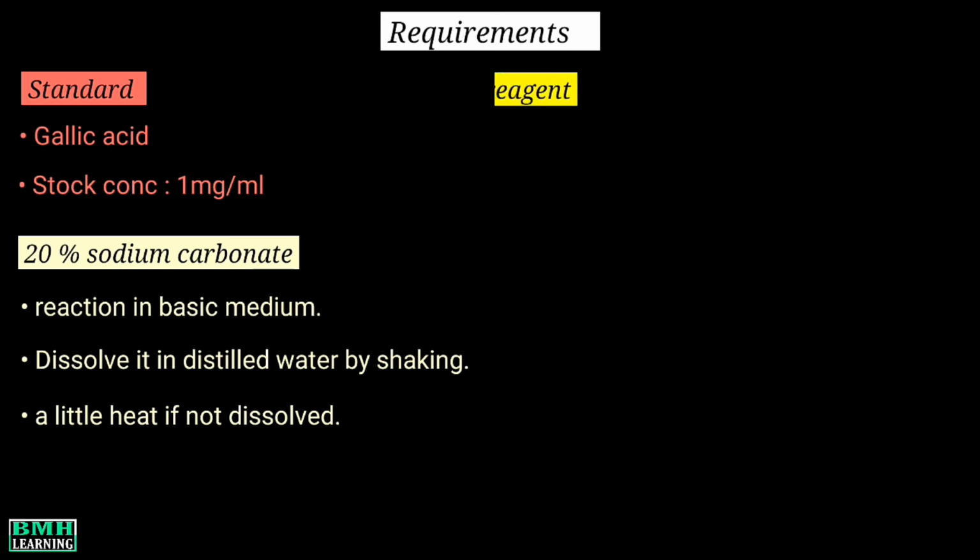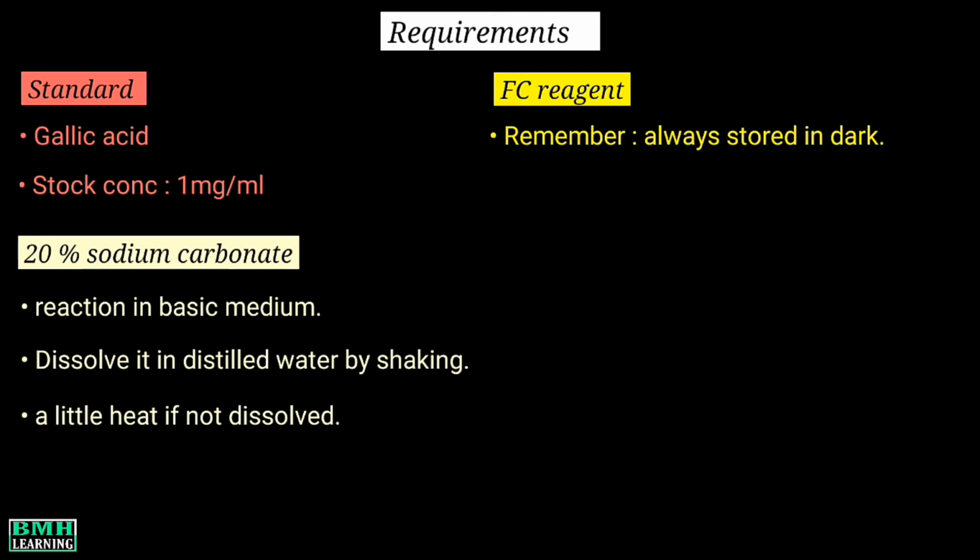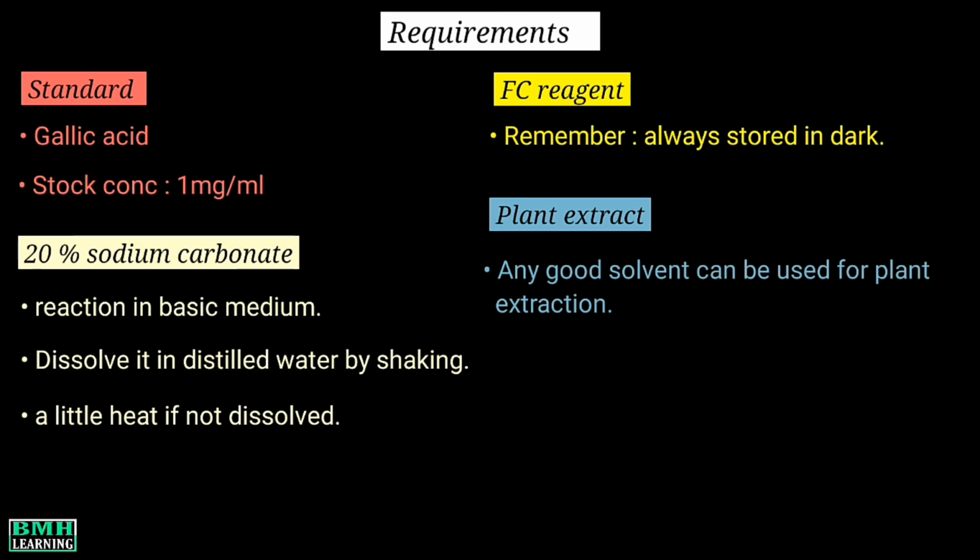Next we need is FC reagent. Remember one thing here, the FC reagent is always stored in dark. Then we require plant extract. Any good solvent can be used for plant extraction. Let's say we are using methanolic plant extract.